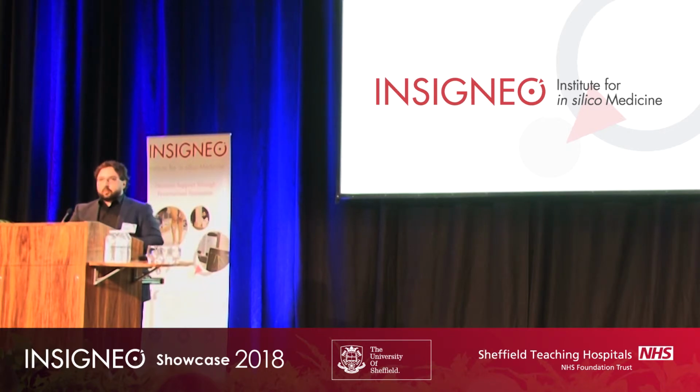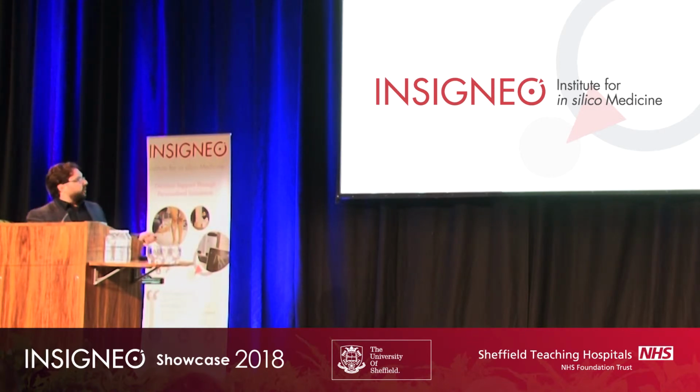Since I arrived here in Sheffield 5 years ago, we did a lot of studies in understanding what is the precision, or the error in this case, in terms of strain measurements for different structures as a function of the nodal spacing of the registration algorithm. And we showed that if we use high-resolution images coming from synchrotron micro-CT scans with resolution in the order of 1.5 microns, we can get errors which are much lower than the ones that you would get for standard micro-CT systems, or even from in vivo micro-CT systems.